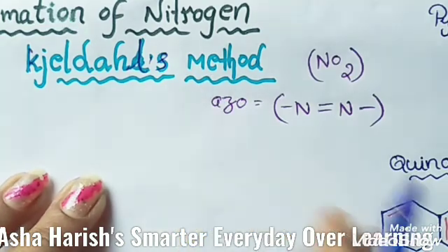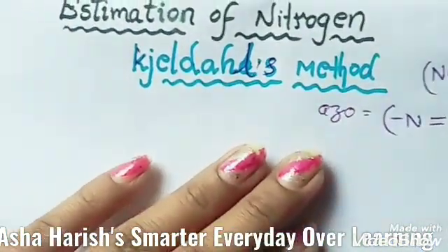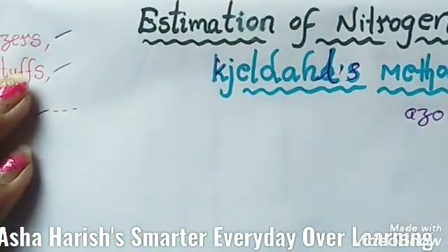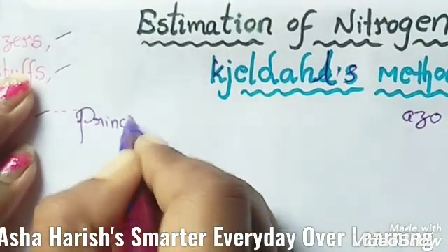Okay students, I'll now explain the apparatus used for the estimation of nitrogen. Let's see the principle. What is the main principle involved in this Kjeldahl method?